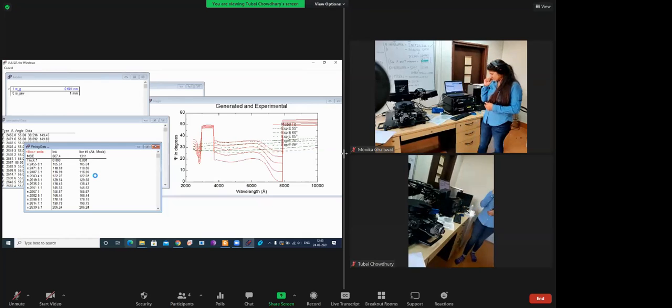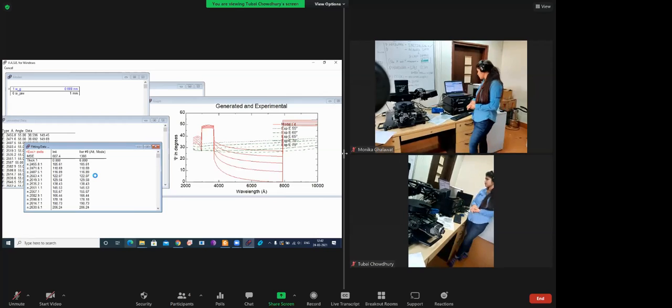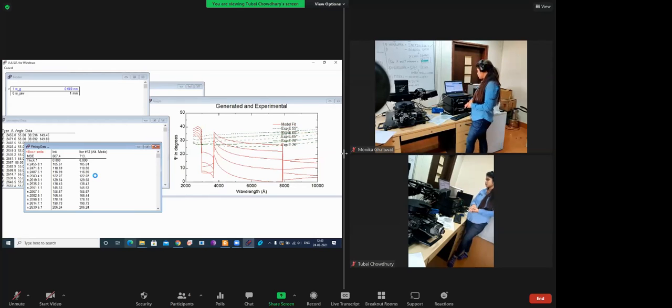Madam, I think you have chosen a wrong model for tungsten oxide over tungsten over the silicon. It is an absorbing film. Metal is always an absorbing film, so you should use a different model, not a thermal oxide model of SiO2.